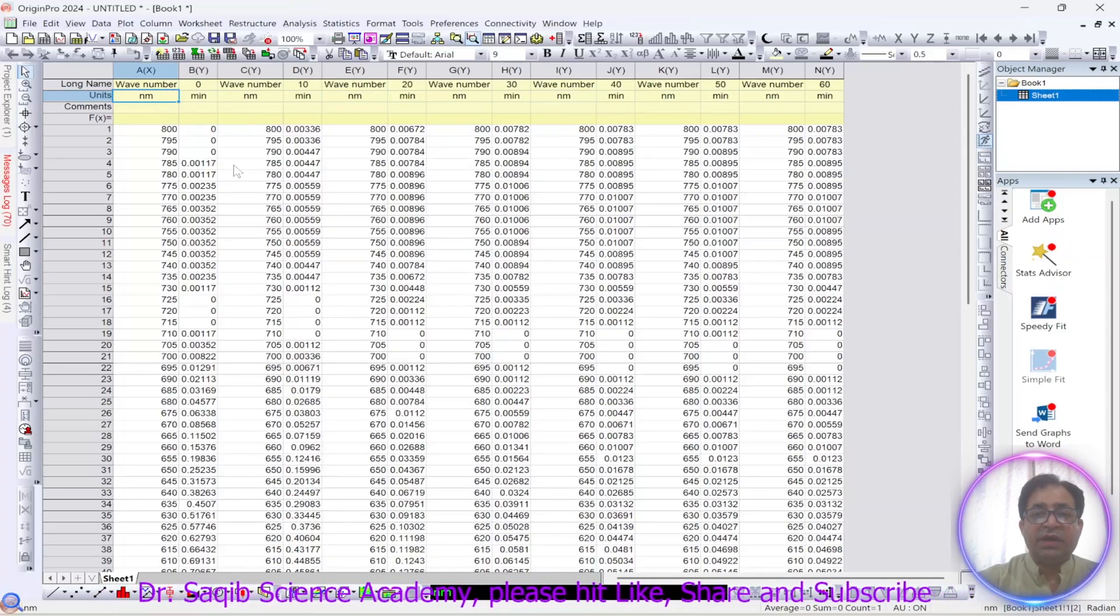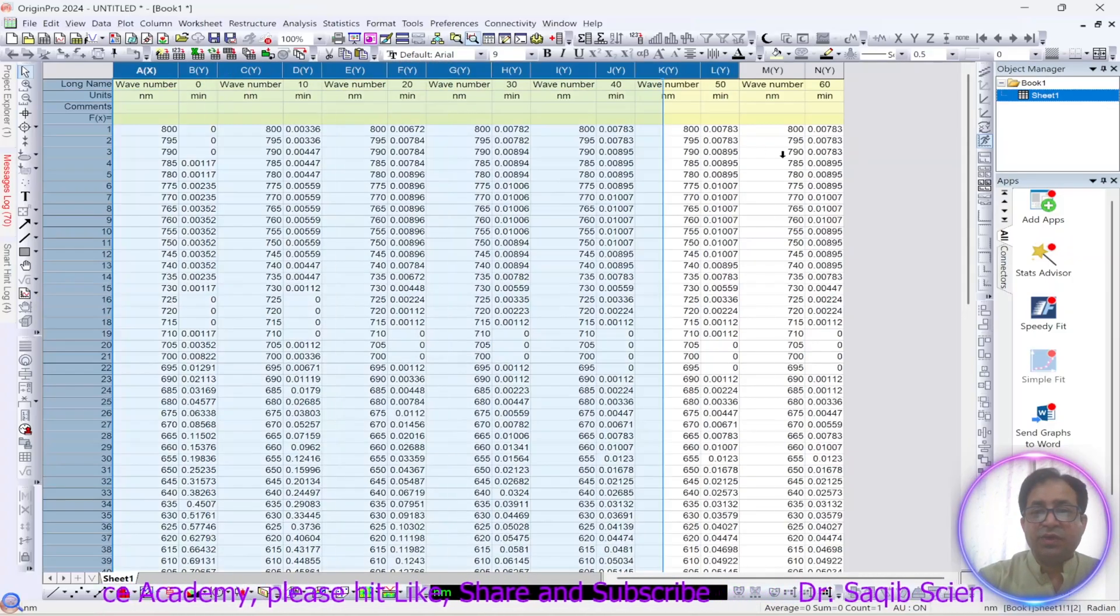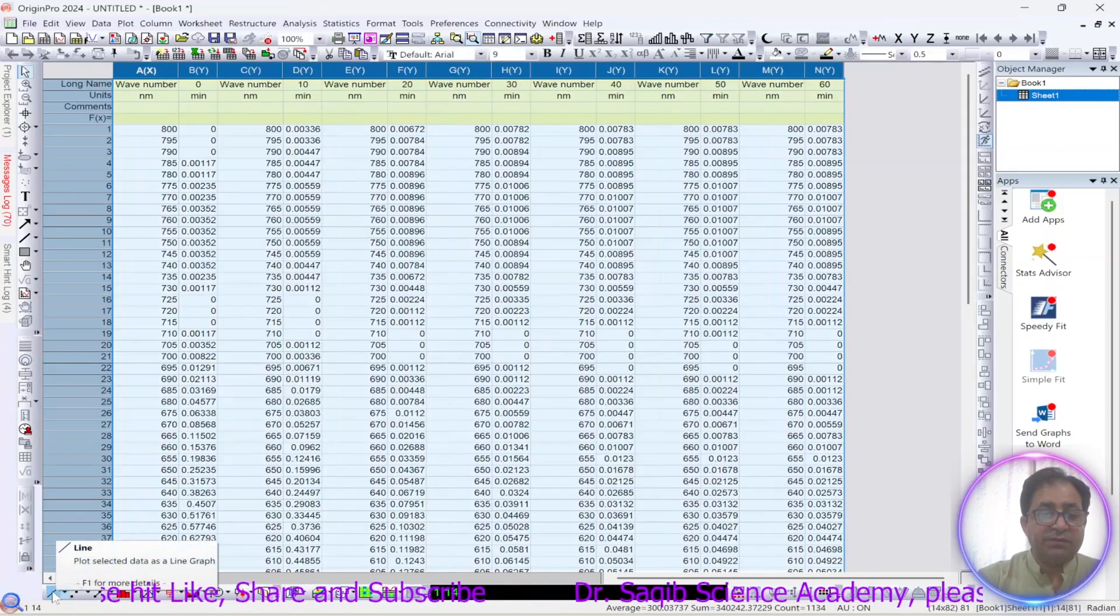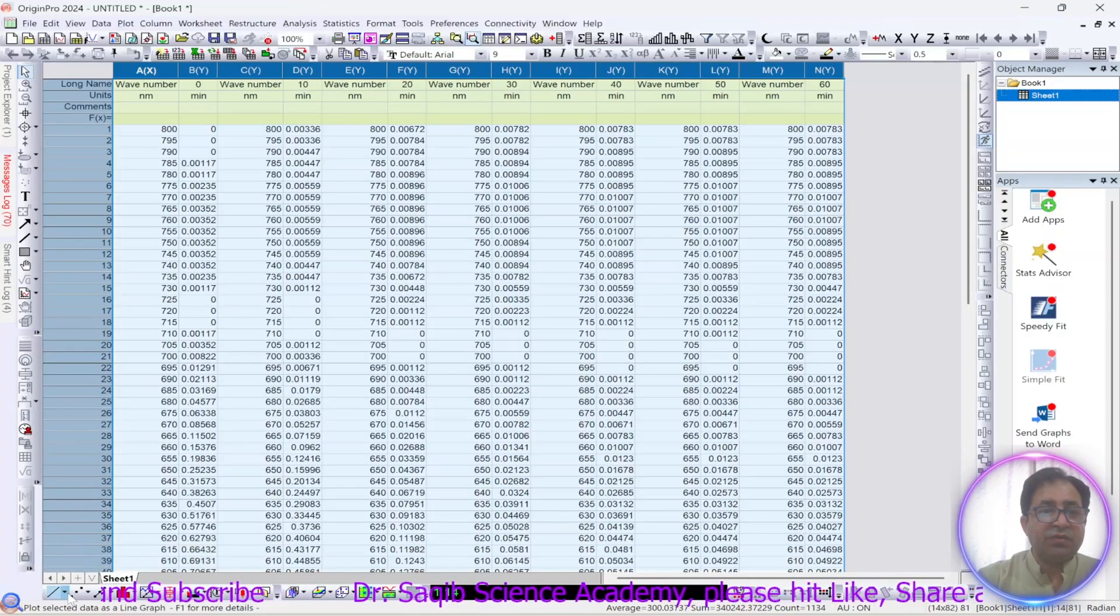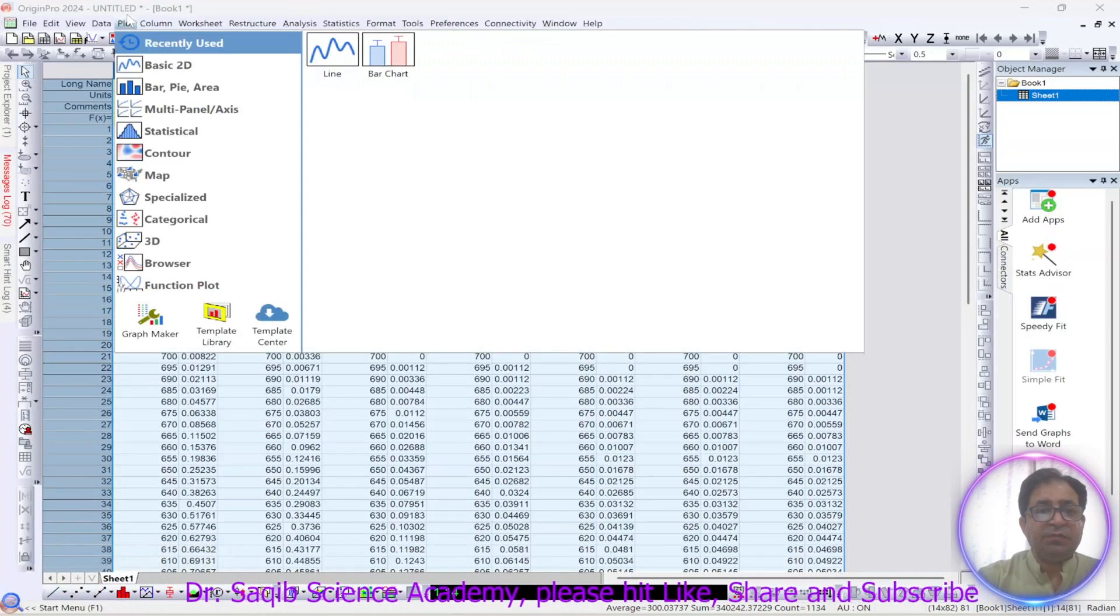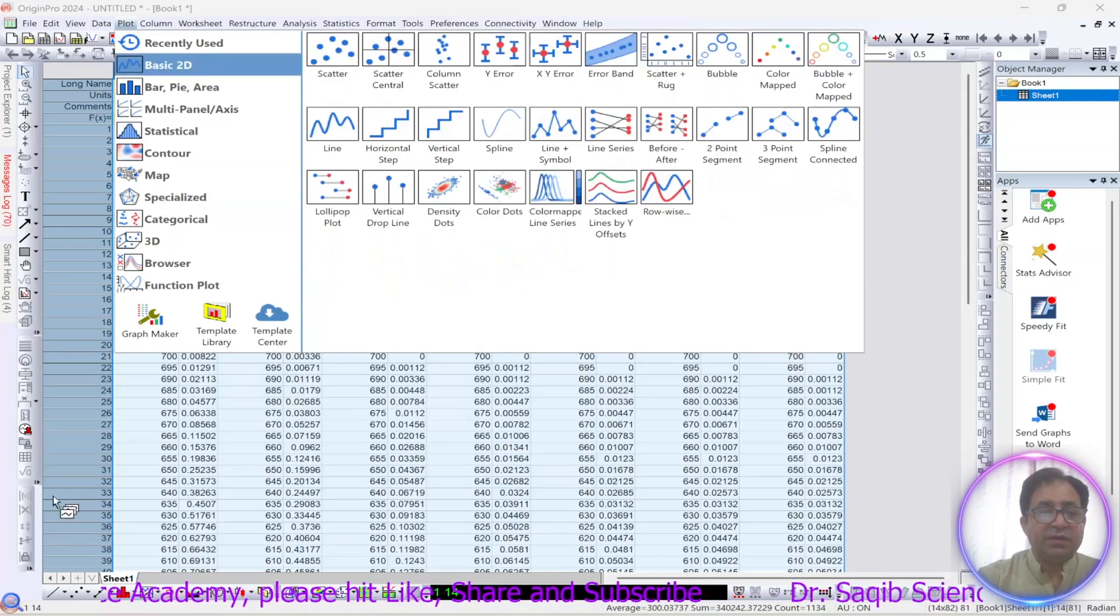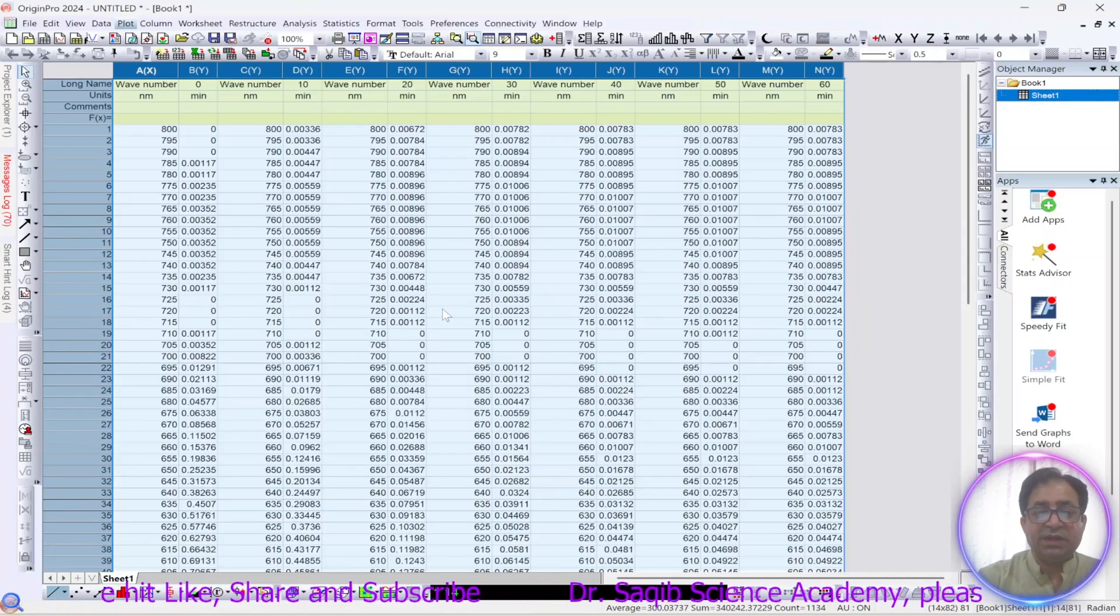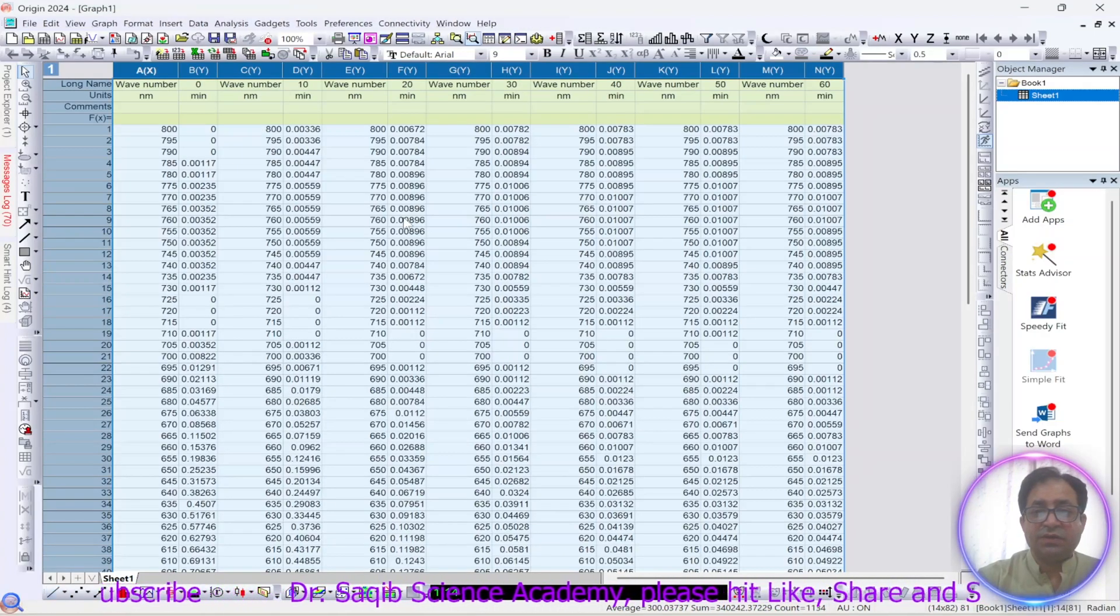Okay, as we don't have to put any formula or anything, so we will select all our data and go to the line graph. Now the line graph you can directly go from here or you can plot it from here. So we will directly go from here. The line will select the line graph and it will draw a line graph for this data for us.